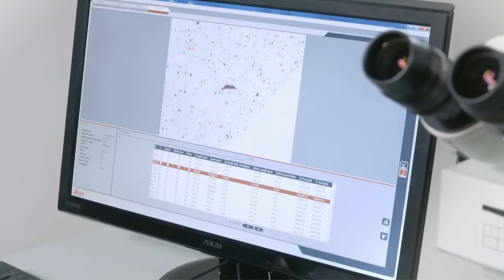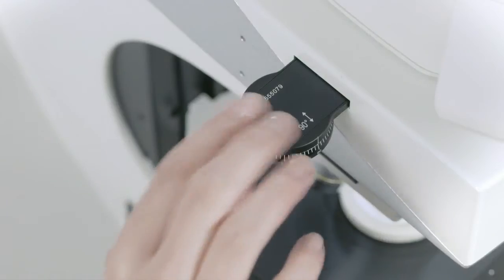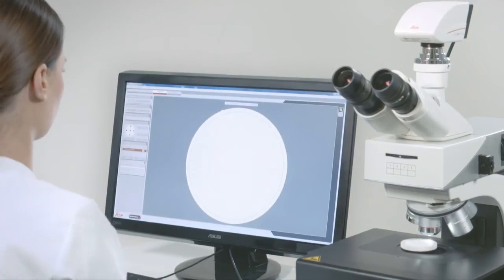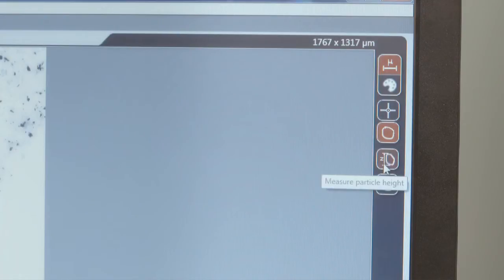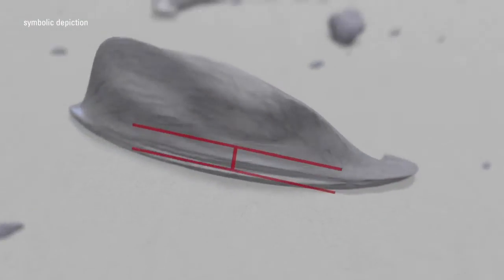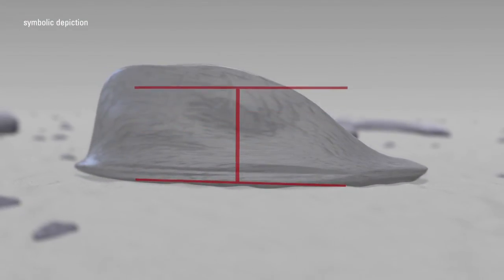The Leica DM 2700M is an ideal microscope for precision measurement with manual adjustment possibilities. Moreover, it's able to measure particle height in order to provide you with three-dimensional information.